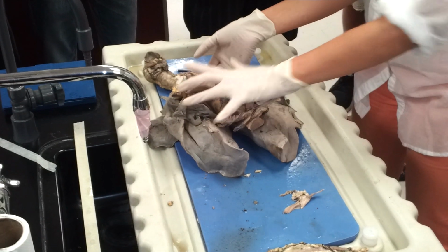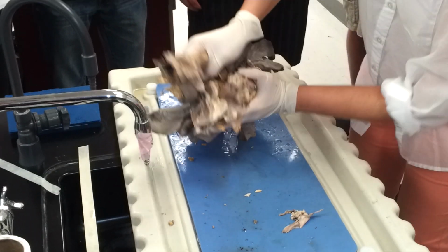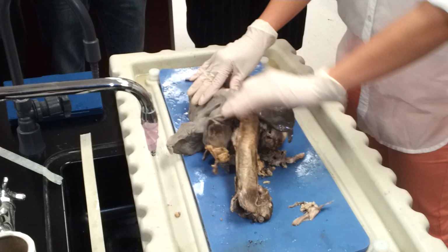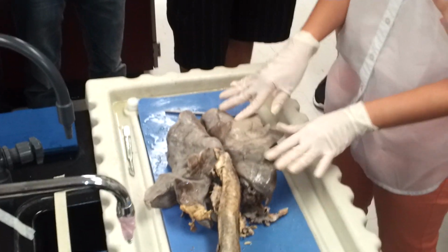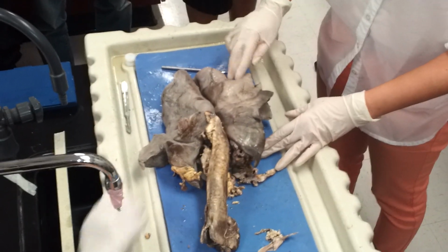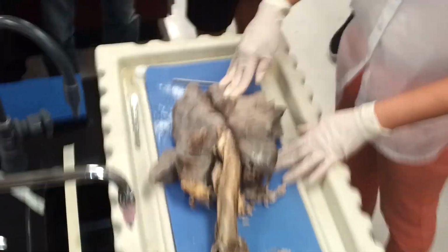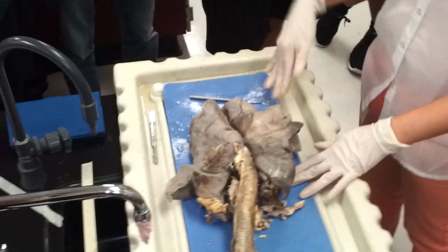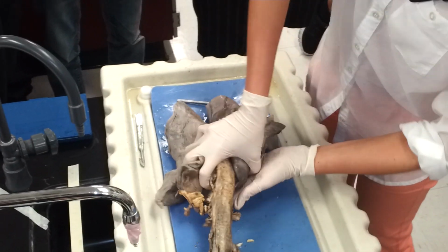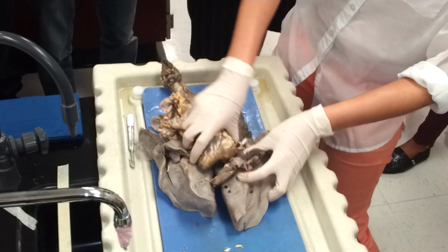Okay, then if we flip it over, you flip it over, you see the difference between the two? The posterior side, or the dorsal side, is a lot smoother. Do you see it? So they say that the dorsal side, or the posterior, is pretty compared to the anterior. So this is pretty, and the other side's ugly. Okay. Now, this is how it was earlier.